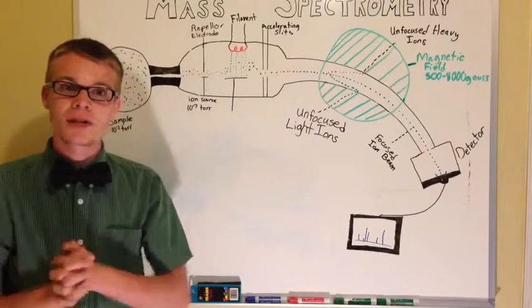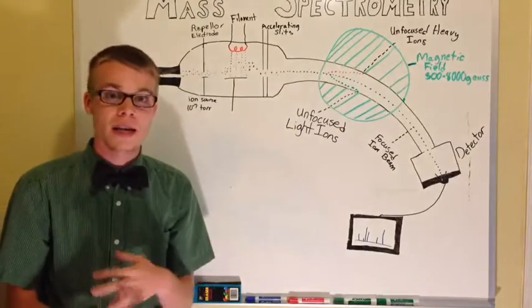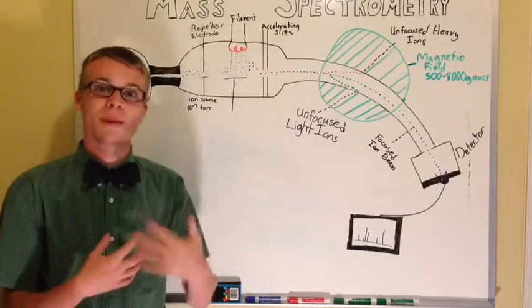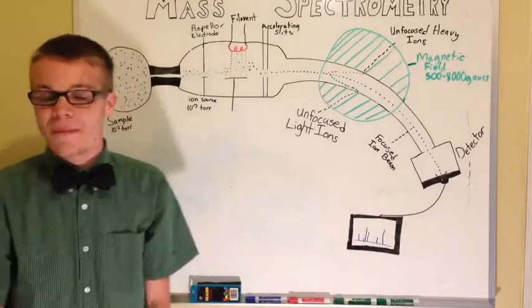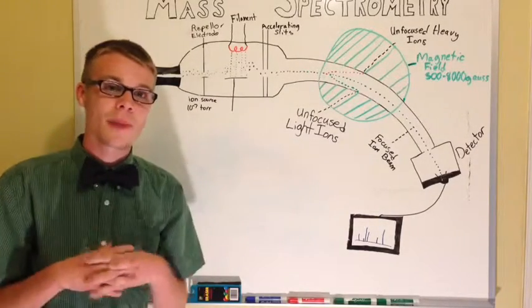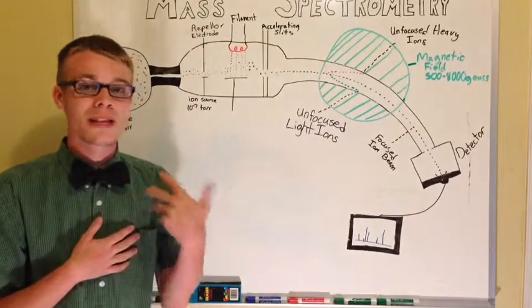So today I'm here to talk to you guys about the Mass Spectrometry, or as people call it, the Mass Spectrometer, or the Mass Spectra, or the Mass Spec. So there's many different names that people can call it. But before we start, we need to talk about terms, or vocab, that you need to know to follow what I'm saying.